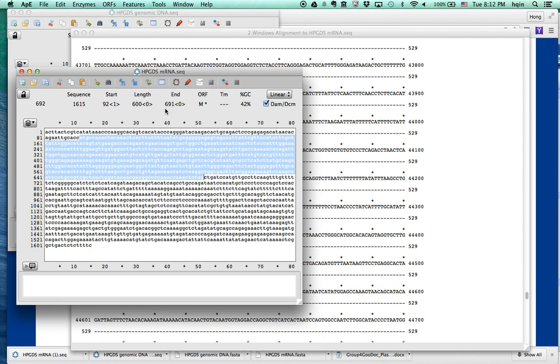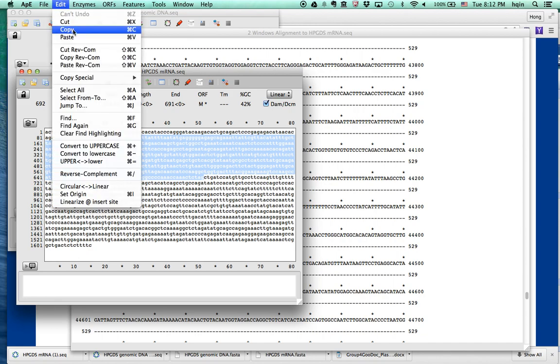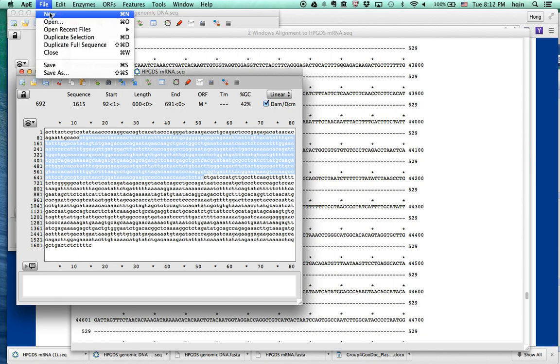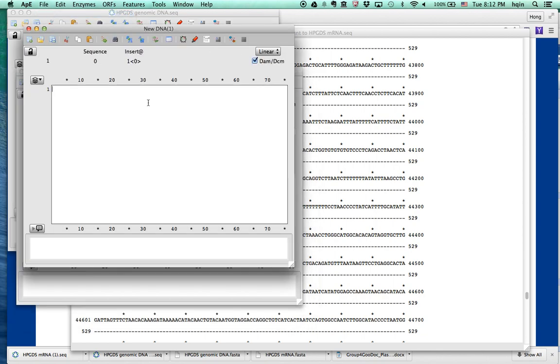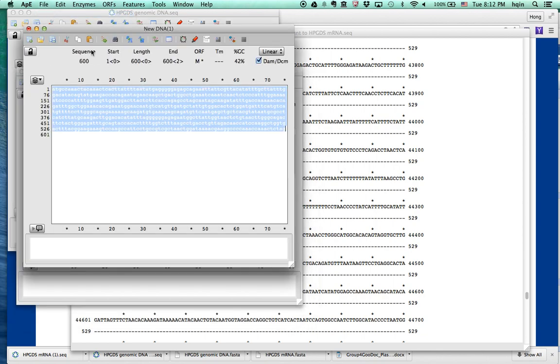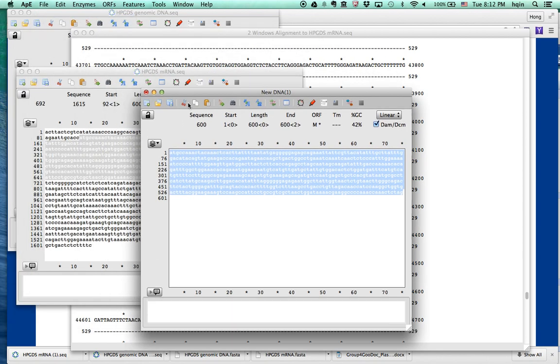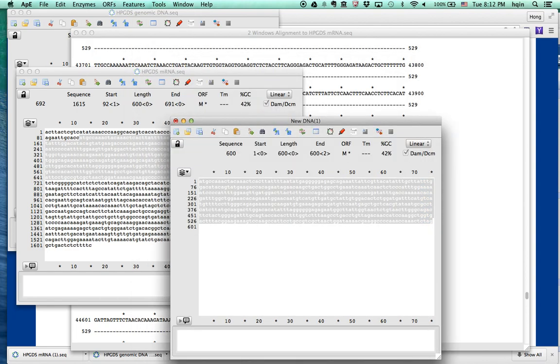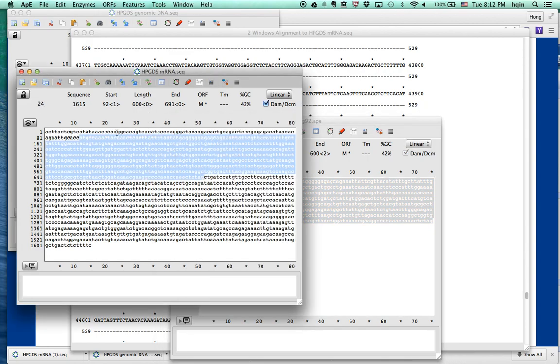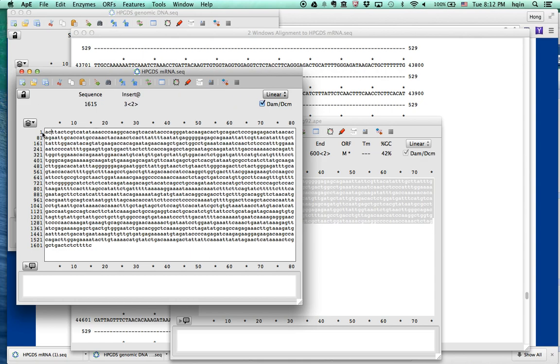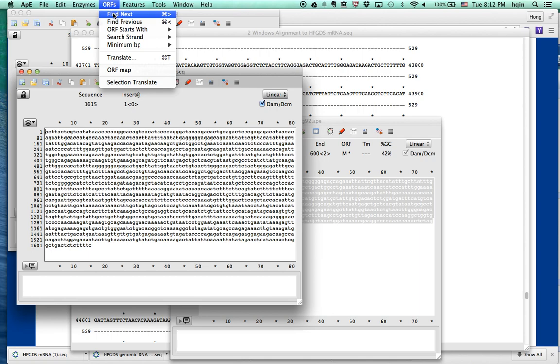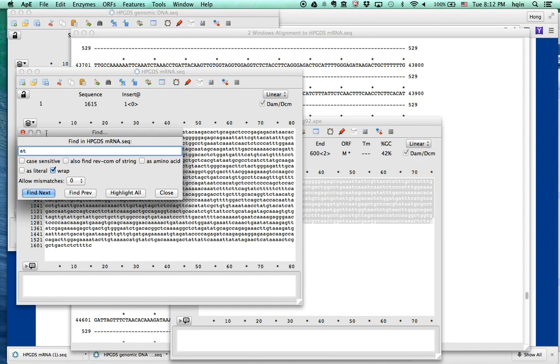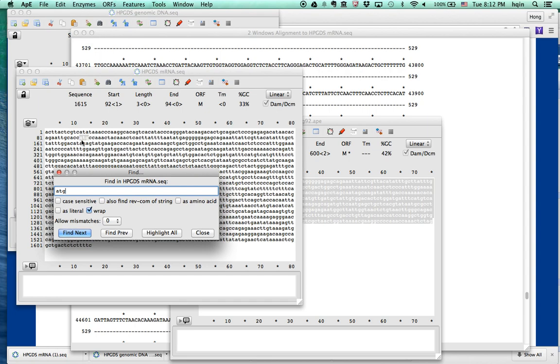Let me do it again. If you are not sure, you can highlight this. Start at 92 and end at 691. So we copy this, new file, and paste this. So I'm going to save this, this is ATG 92. Is there an ATG before this? You can try. Let's try again. Find next. It looks like that's the first ATG. Let's search again ATG. It looks like the first one is here.